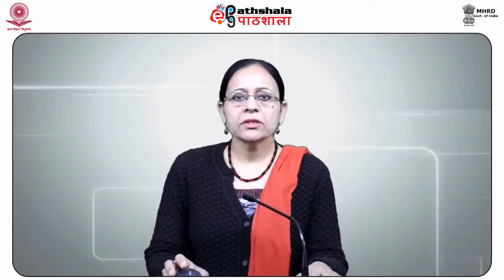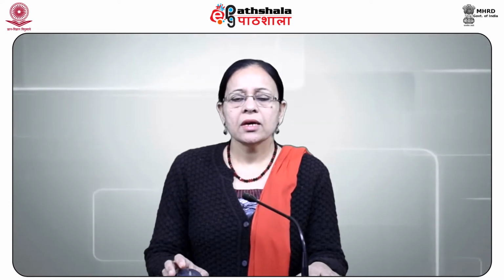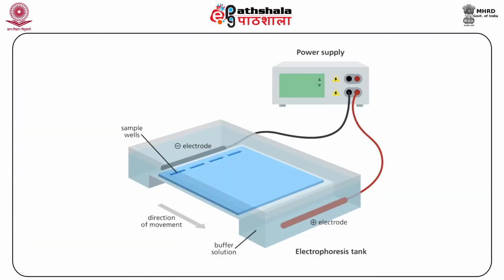When DNA is subjected to the enzymes, the enzyme recognizes a particular sequence and cuts these sequences into two or more fragments. These restriction fragments are then separated by gel electrophoresis. The gel electrophoresis separates the pieces of DNA based on their size. These fragments migrate towards the positive electrode, and the smaller fragments move faster than larger fragments, thus separating the DNA samples into bands.